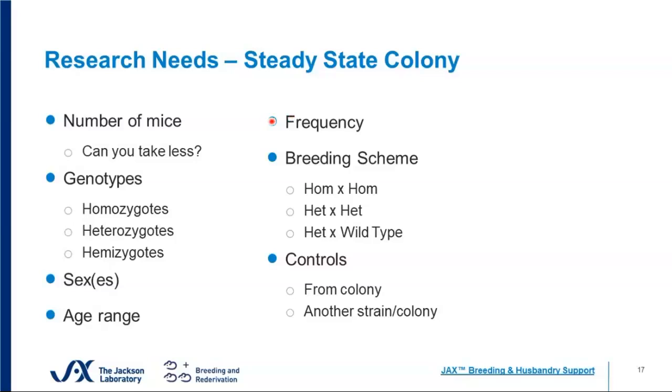You may hold them longer. Some you may hold only to 12 weeks of age, some you're going to take to 26 weeks of age, some to a year of age. But it's how frequently you need them, right? So if I need 5 cohorts of mice that are all 3 months apart in age, I just walk through this, and my frequency is every 3 months.